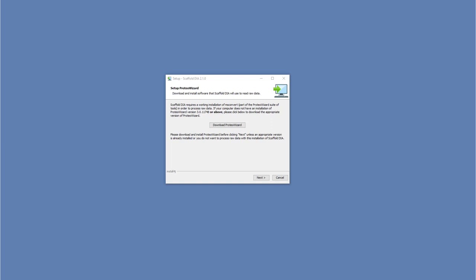Note, this will download a separate installer. Work through the ProteoWizard installer to completion before returning to the Scaffold DIA installer.